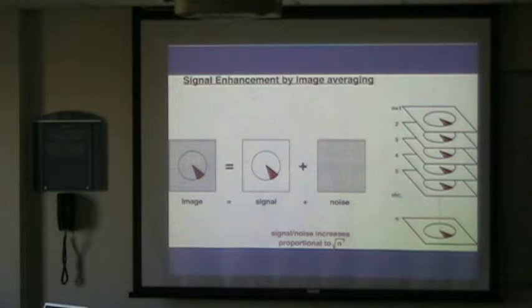Now the second thing we have, the second problem, is a particular electron microscopy issue. We have noisy images, sometimes in light microscopy too. So we need to do something about the noisy images, and the easiest thing, if you can, is what we call image averaging, which means we have the image overlaid with noise, so we have a signal component and a noise component. The way I would imagine this is if you watch TV somewhere in the mountains, and you have a bad reception, you get that snowy, flurry stuff. That's the noise, and the noise is a random thing. It has nothing to do with the signal in principle. It just overlays the signal. And the signal you can consider as a constant function, at least in an image.